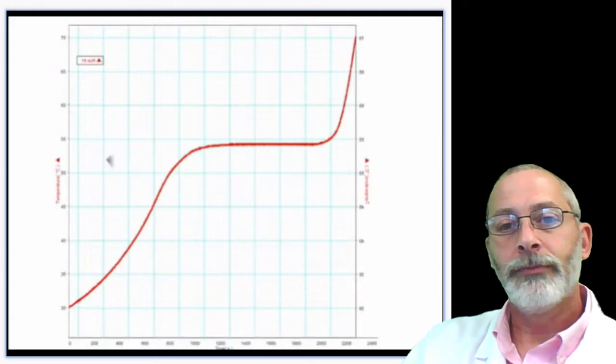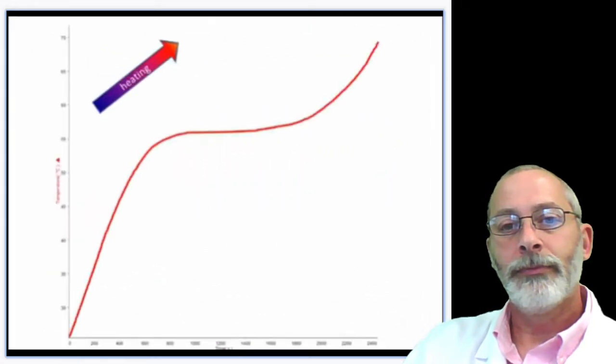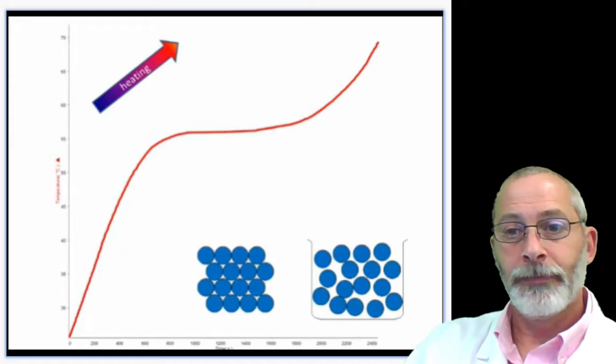But this isn't exactly what it would look like if it were being heated up, because it would heat up more rapidly at the beginning and then less rapidly at the end. So the graph of a heating curve would look more like this. The flat bit of the graph happens when you change state. Here the stearic acid was a solid, and here the acid is a liquid.